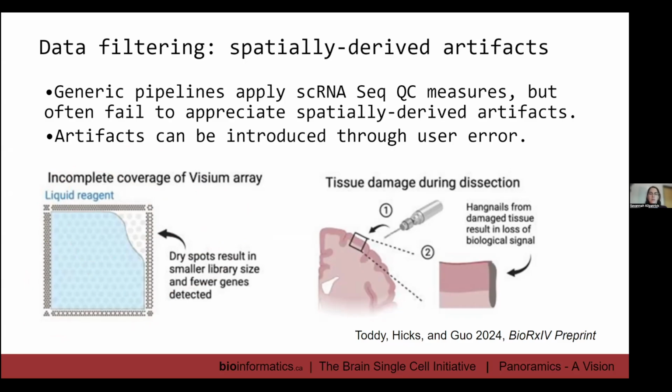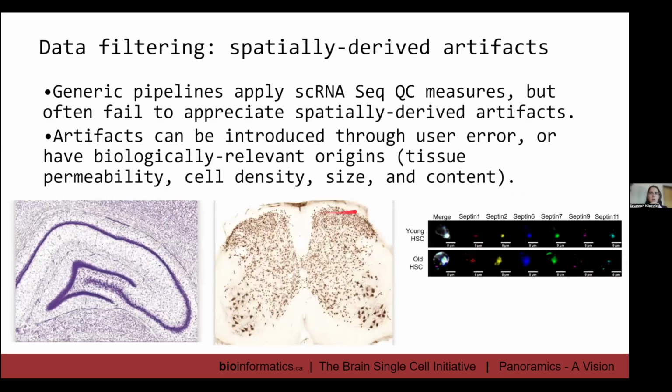there's going to be some sequencing errors, maybe a reduction in the depth. If you're working with really fragile tissues, in the past I've used a lot of organoid tissues. They're really subject to shearing, they fold, they're really challenging, and that is a very clear technical error that can be introduced. But I also want to highlight that there's a lot of biologically relevant artifacts, you could call them, that will influence your data.